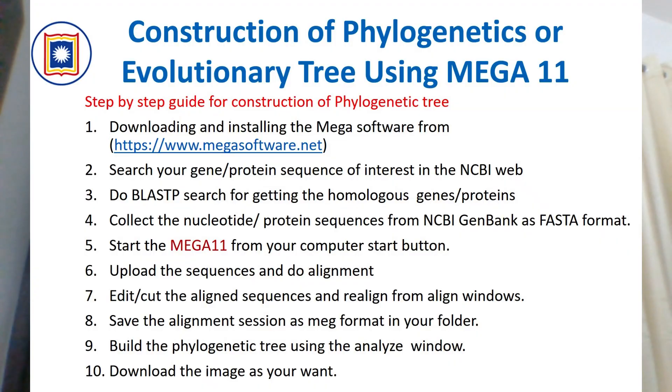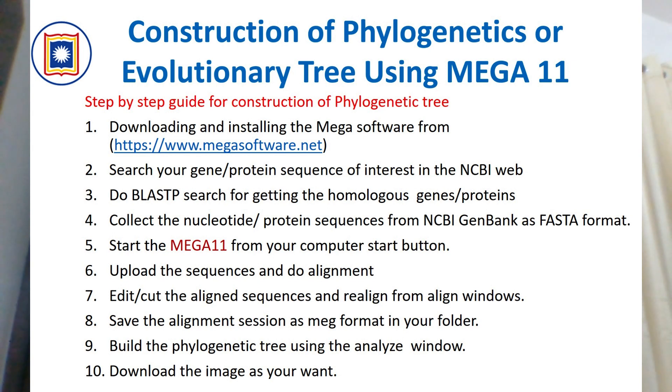This is a bioinformatics tutorial that will be useful for master's students in molecular biology or bioinformatics. I will show you the step-by-step guide for construction of phylogenetic tree. First you have to download and install the MEGA software from the megasoftware.net website.